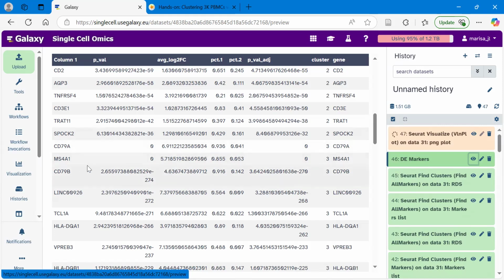So obviously we've seen here in our list of the differentially expressed genes that those are associated with cluster 3. So in our violin plot, we will expect to see that most of the cells expressing these two genes are in that cluster. That's two different ways that you could be identifying your genes. You could either look at your list of differentially expressed genes and search them up in databases, or Google them just to see what types of cells might be expressing them.